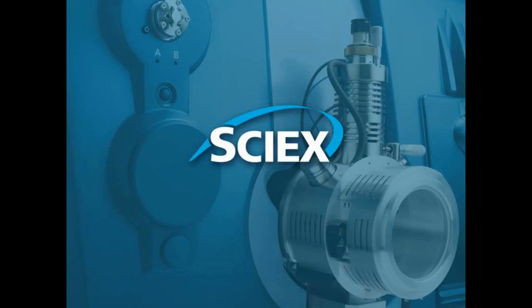Great, thank you. Our next question, can you connect CESI to different types of mass spectrometers? Yes, you can. As I mentioned, I've run CESI-MS on Triple TOF systems, including the 5600. You can also connect it to 6600, 4600 from AB Sciex, but I've also connected it to Q-trap systems, and you can also connect it to triple quadrupole systems as well. Basically any system which will fit a nanospray source which can hold the adapter for the cartridge, you can then connect it to mass spec.